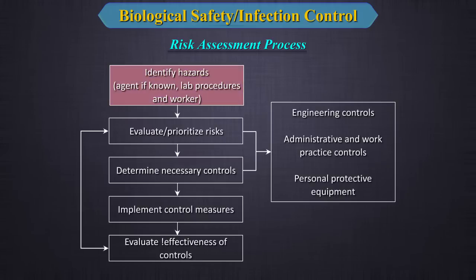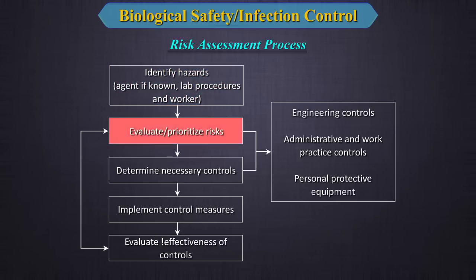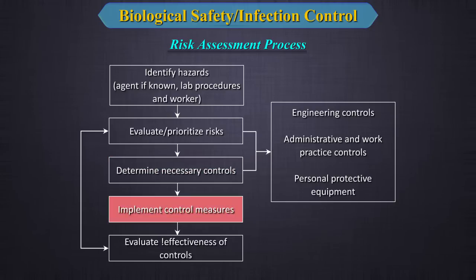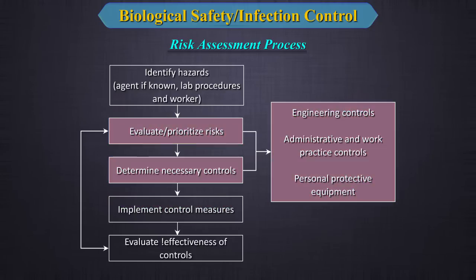The process also involves evaluating the likelihood that an exposure would cause a laboratory-acquired infection and the severity of consequences if such an infection occurs. Then, develop, implement and evaluate controls to minimize the risk. The risk assessment process flowchart begins with identifying hazards — the agent if known, the lab procedures, and worker hazards — then evaluating and prioritizing risks, and determining necessary controls.